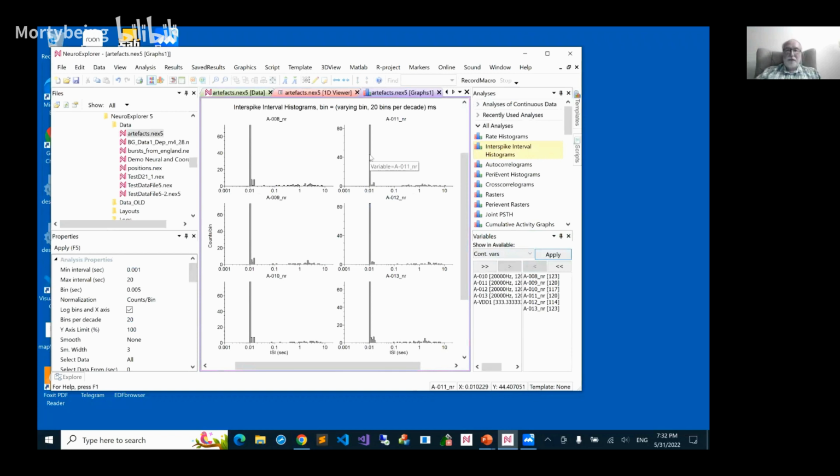So we use all the data to analyze, and basically all we see is just artifact data. It was a frequency of every 10 milliseconds. So every 10 milliseconds we have the artifact, and this is the real data. So how to get rid of this one?